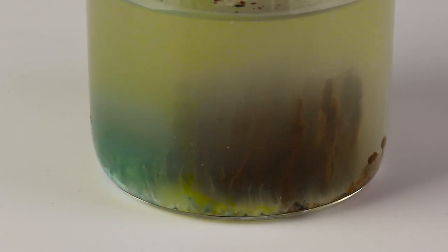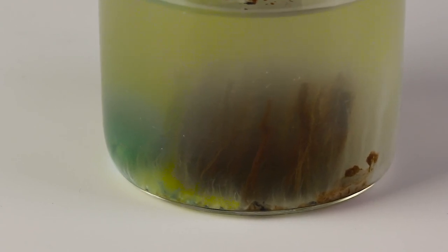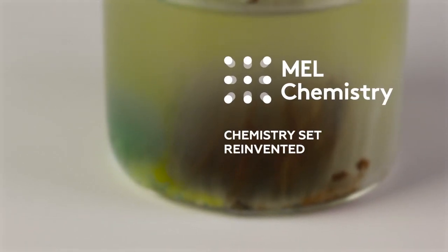Zinc hexacyanoferrate remains colorless, and therefore no color change is observed. Learn more about this experiment on our MEL Science website.